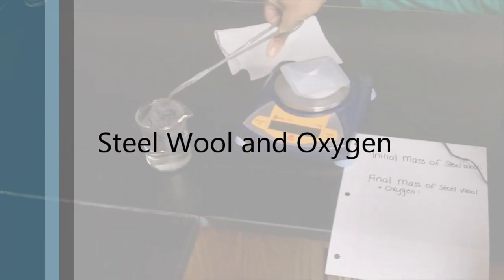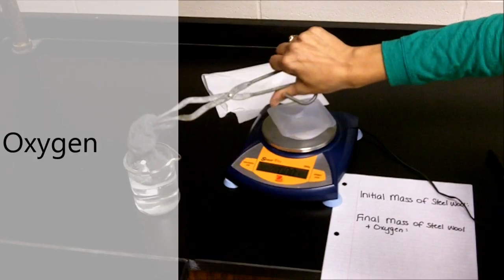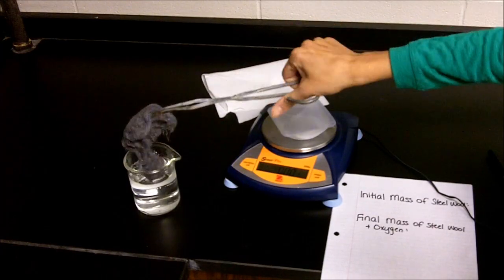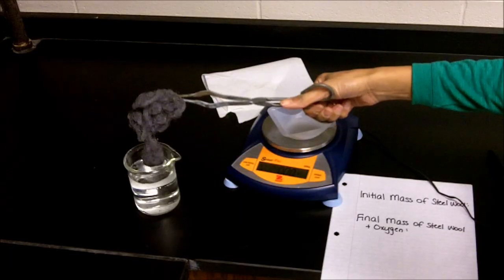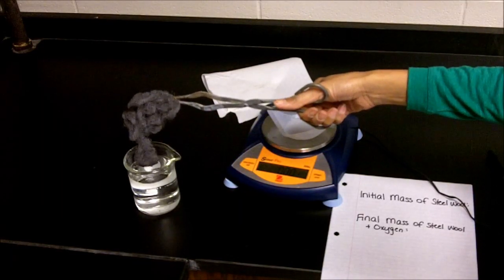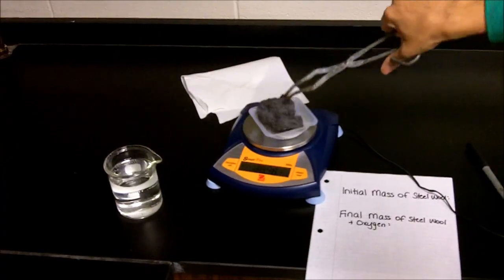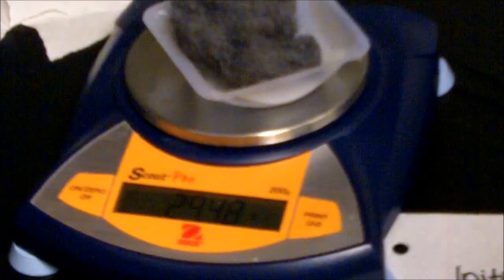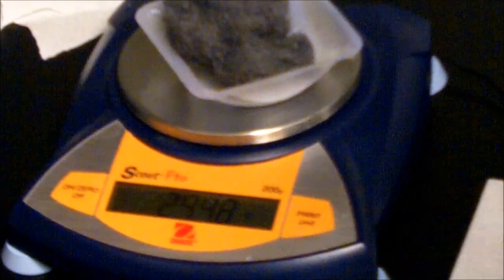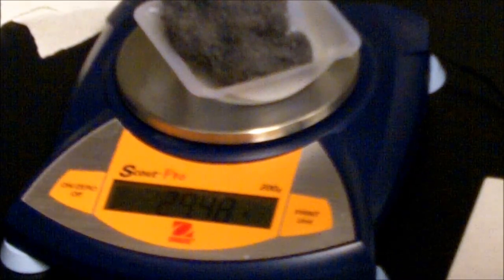I have a piece of steel wool here soaking in some vinegar. I wanted to let the vinegar get rid of any other metals or anything else that might be on the steel wool. I'm going to go ahead and take the mass of the steel wool — there is some vinegar on there, so I need to account for that. The initial mass of the steel wool is 29.48 grams.